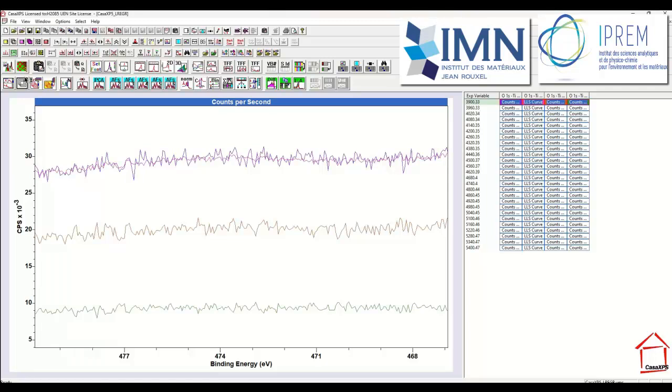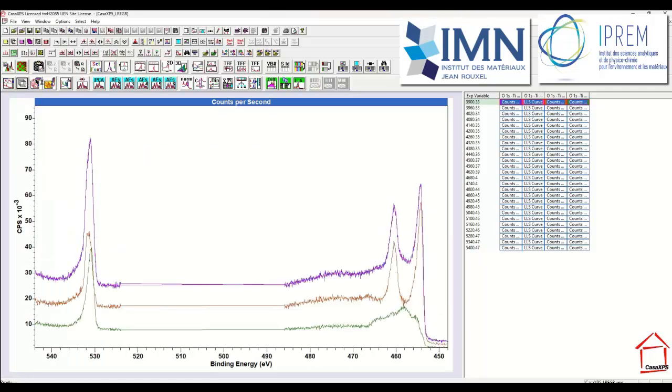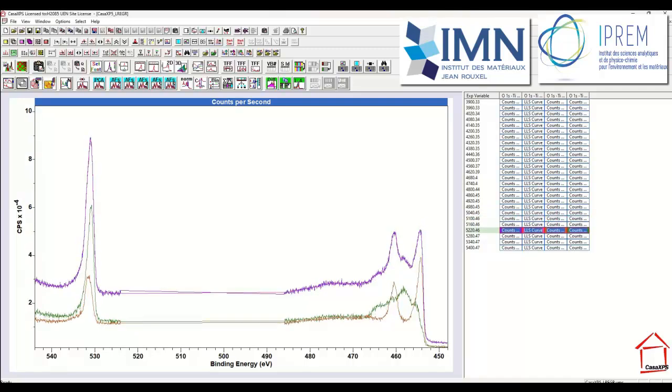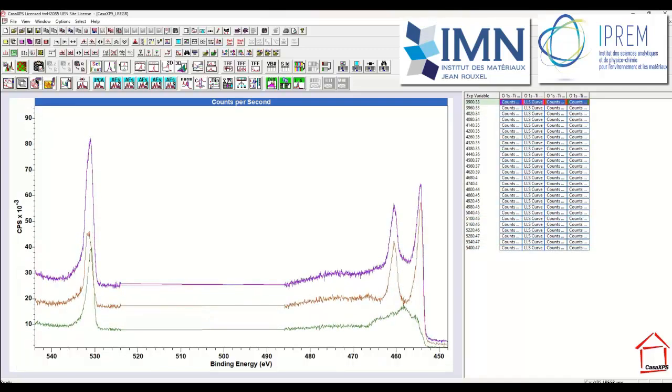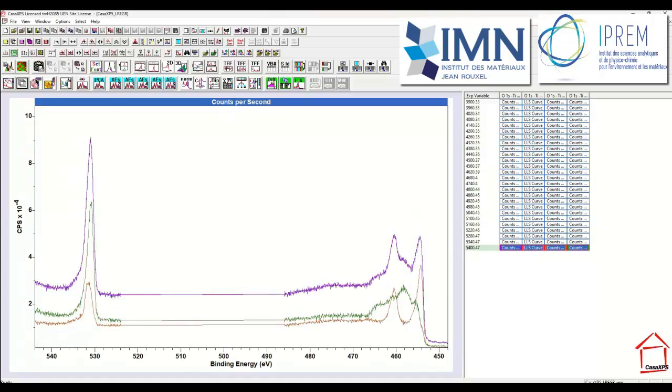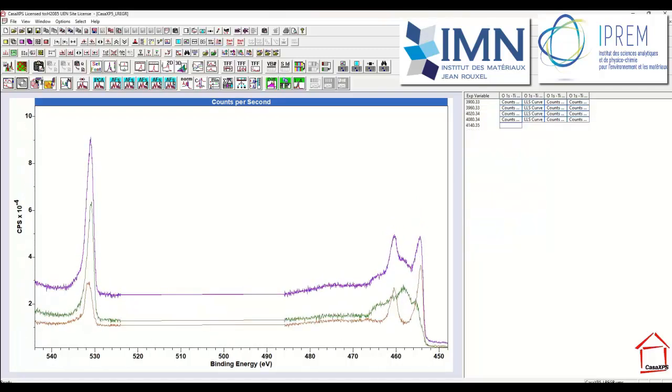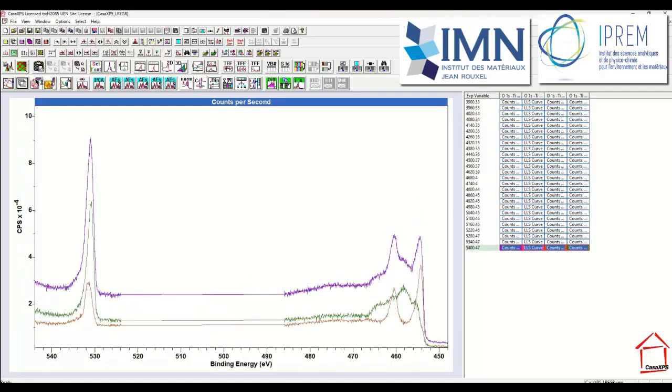So let's have a look at this again in more detail, and we will then use the arrow key to step down the selection, and we can observe how the data change over that interval of the profile, rather the oxidation sequence. Here we can see that we have a plausible answer in terms of we've got some titanium that is clearly related to oxygen, that has a much more metallic-like look to it, so a reduced oxidation state here.